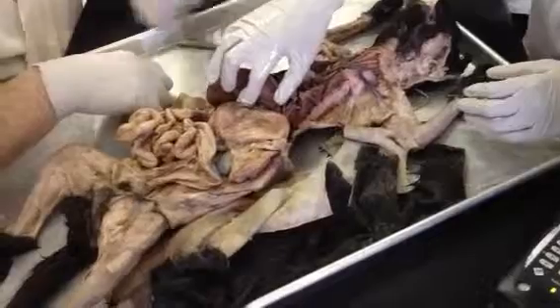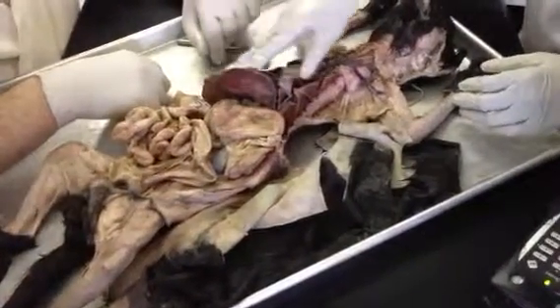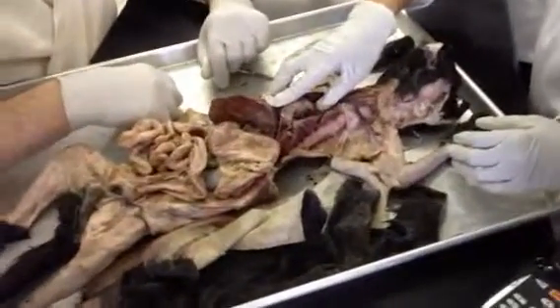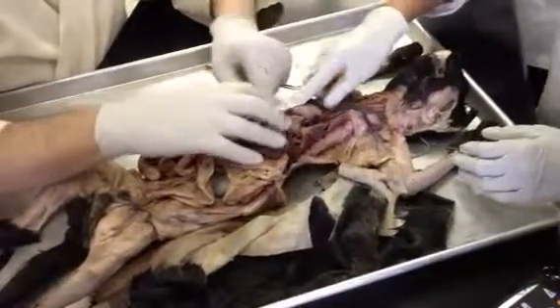How about the ligaments? Falciform and the round, do we have to... Yep, I'll show you the falciform ligament. Now the round ligament on the cat, I've asked students to scratch it, because it doesn't show up on the cat. But the falciform ligament definitely does.